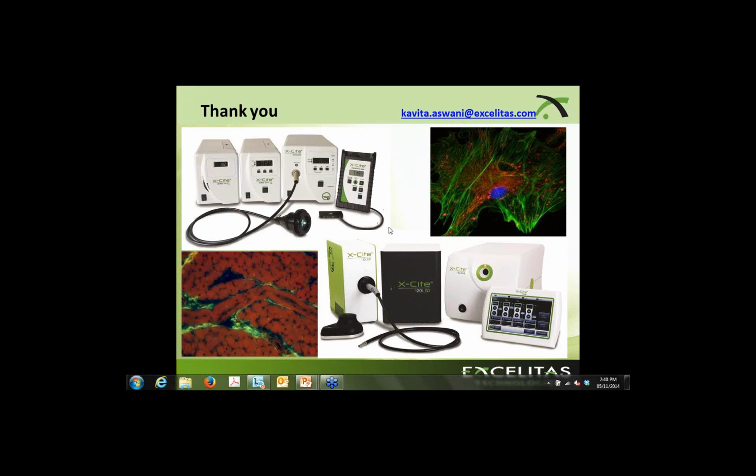Okay, we got a question from Marcel. He says, I want to scan my samples with the whole spectrum from 350 nanometers to 700 nanometers in 50 nanometer parts to detect natural fluorescence. The non-continuity of the LED lamp spectra, is that a problem for reproducibility and intensity comparison between different parts of the spectrum? Would lamps still be better, or should I switch to LEDs? That is a tricky one.